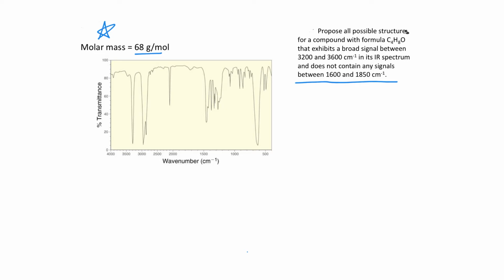So we're not going to get too detailed, but we can add up carbons that weigh 12 and hydrogens that weigh 1 and so forth. So that's going to be helpful. And then we have our IR data. And again, we have the lines that we're supposed to draw on the spectrum here to try to find interesting peaks.